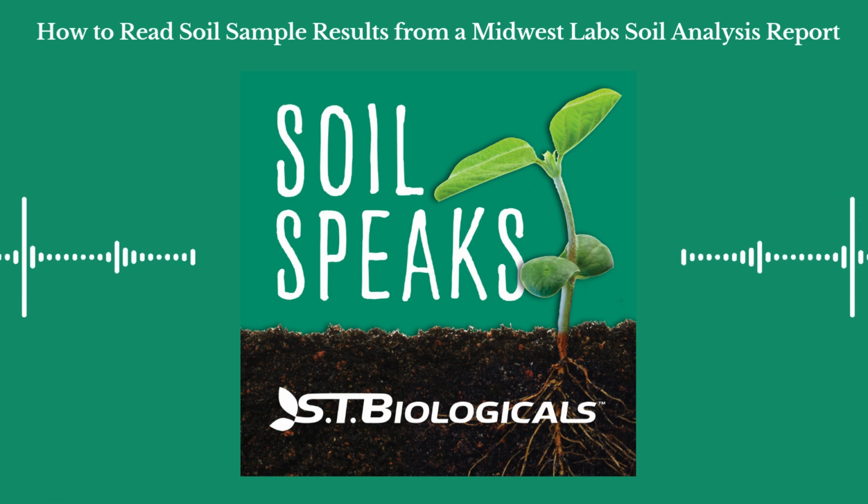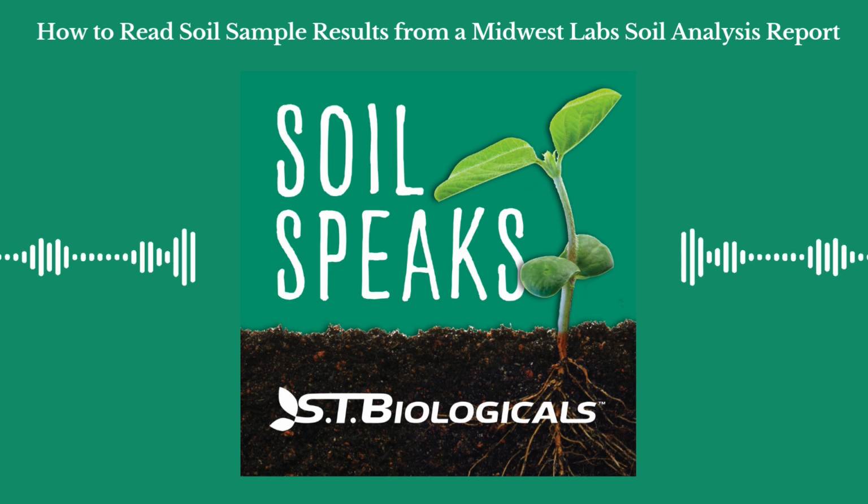When you are deciding where you'll send your soil samples, ask what type of sampling method the lab uses. For example, Midwest Laboratories uses the DTPA test. If you've previously had soil samples using the Mehlich 3 test, the results and recommendations will differ from your DTPA results. Always ask what sampling method a lab is using for analysis. At ST Biologicals, we send some of our soil samples to Midwest Laboratories for analysis. Let's walk through how to read a Midwest Labs soil analysis report.